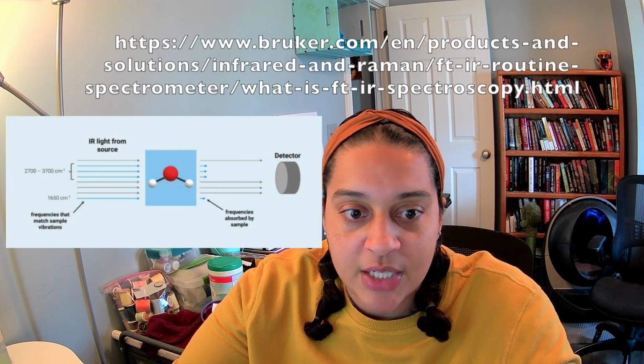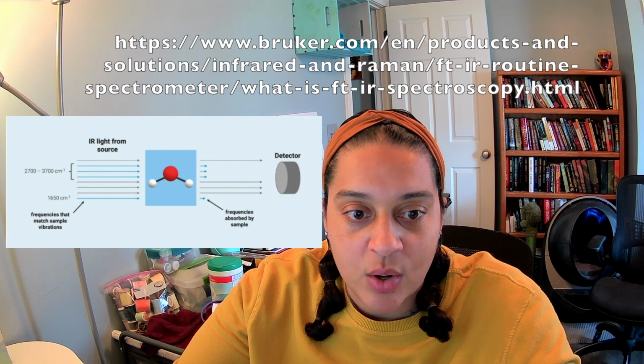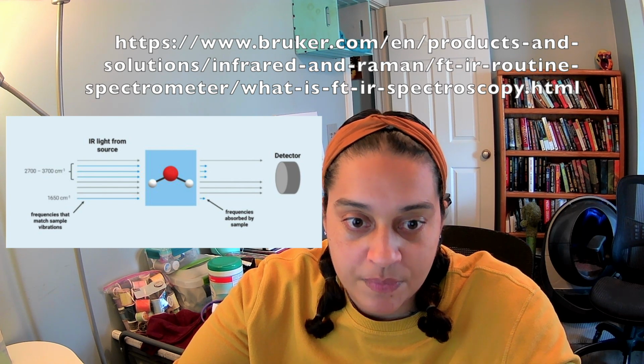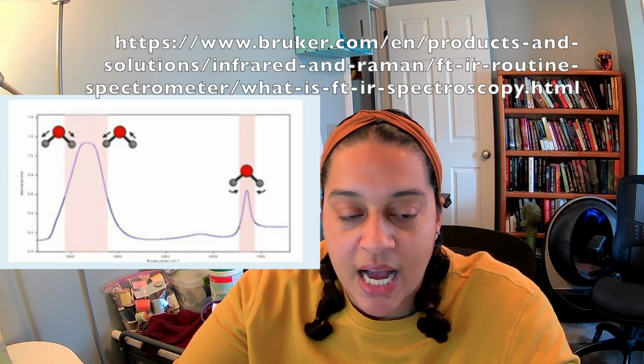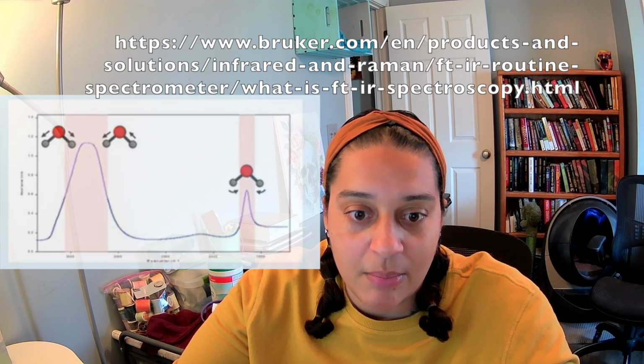IR light is shown through a sample. The compound will absorb some of the frequencies of light, which will excite the vibrations. The detector can tell which frequencies are absorbed because they will be missing from the light the detector receives. The information gathered from the detector is then plotted, giving the IR spectrum unique to that compound, a fingerprint, if you will. The plot shows what frequencies of light were absorbed, which translate into which vibrations were excited when the light passed through the sample.